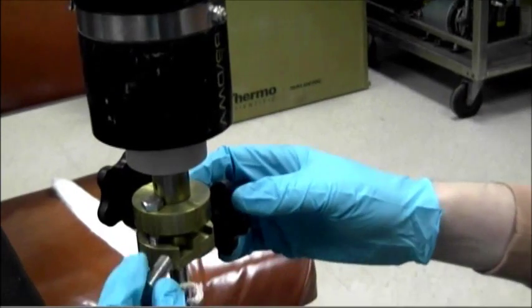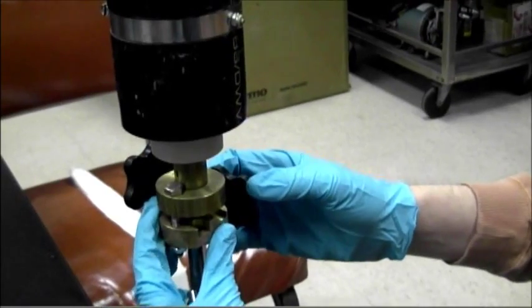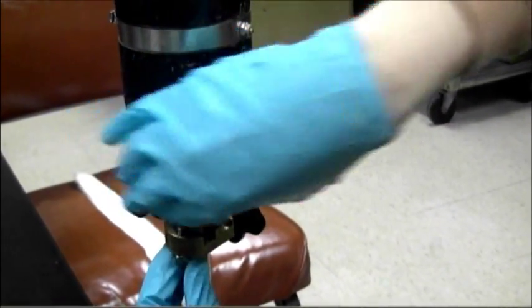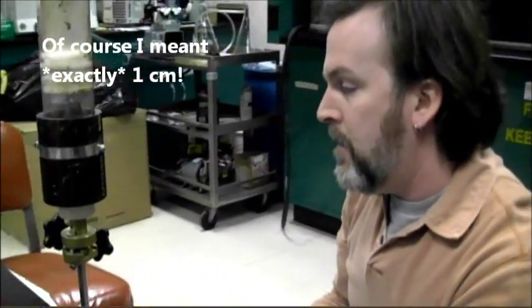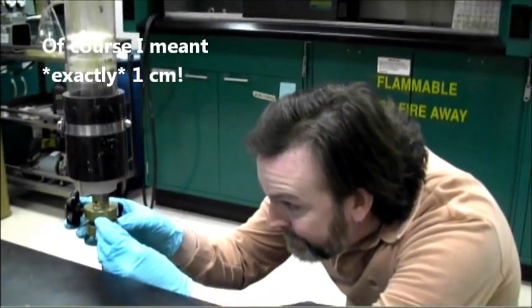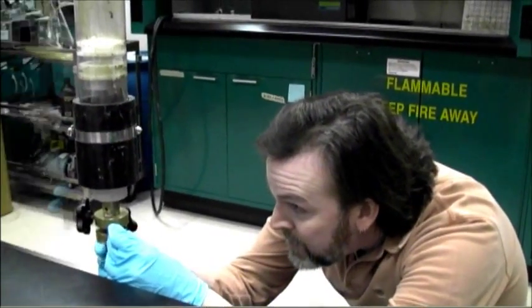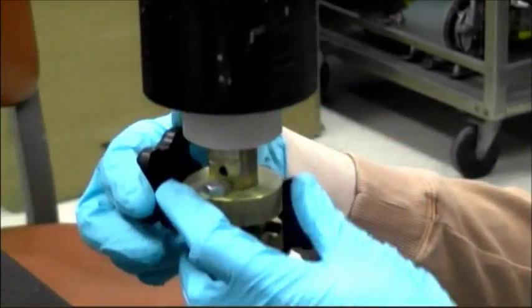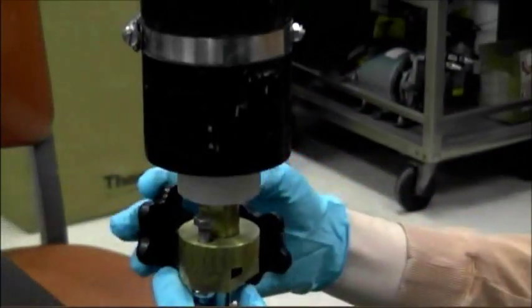Since I'm going to calibrate to one centimeter, I am going to loosen this so that it drops down approximately one centimeter. That's pretty close. Now we've got the spacer calibrated to one centimeter. So every time we drop this down, it's going to push the sediments up one centimeter at a time.